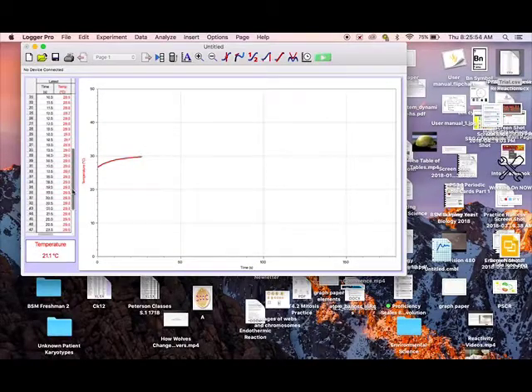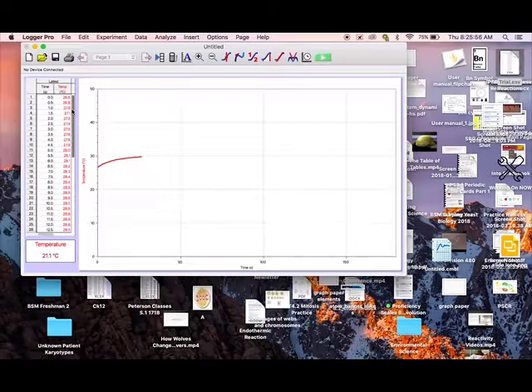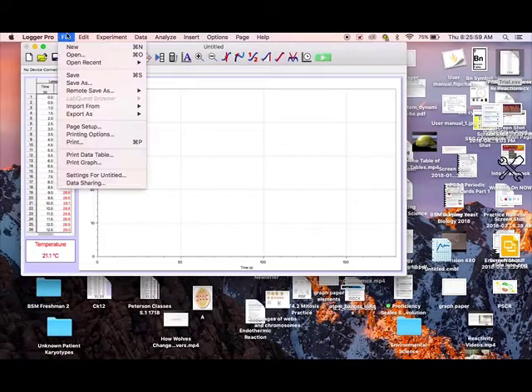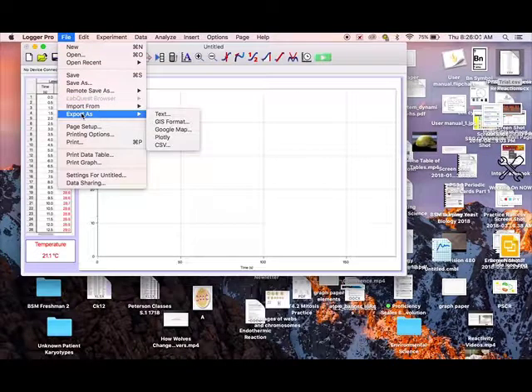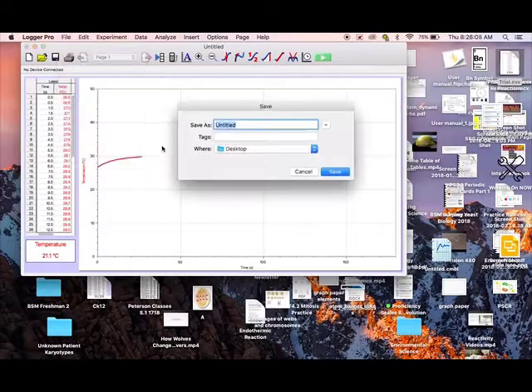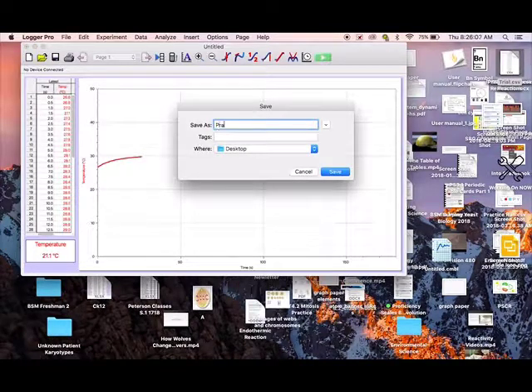Hey, this is Mr. Peterson. Here's a short screencast. I'm going to show you how to add all the data that you're going to collect, your graph, and put that into Google Spreadsheets. You're going to export it as a CSV, comma-separated value.